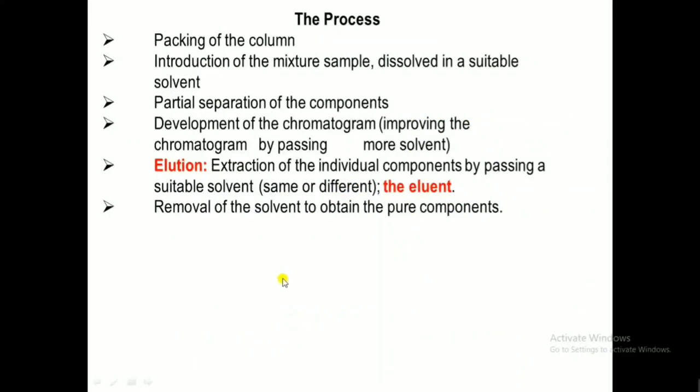Let's see what the processes are in liquid solid adsorption column chromatography. If you remember the YouTube link which I sent to you when we started this class, those steps were regarding adsorption column chromatography. The first step is the packing of the column. This is very important. We have to pack the glass tube with the stationary phase, silica gel or whatever solid stationary phase we are using.